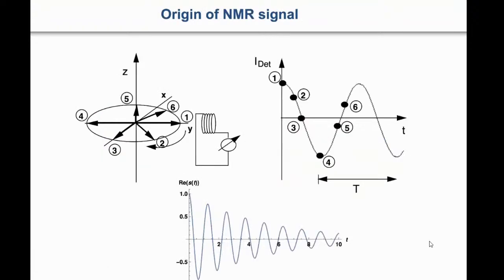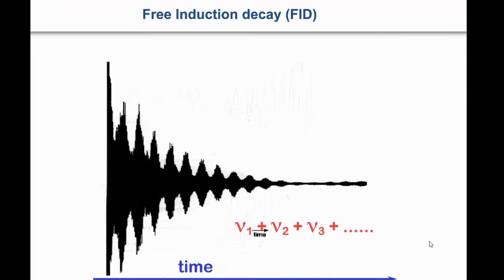Now, how do we do it? In reality, we digitize it, where there is an analog to digital converter, which digitizes all those points. We take these digital points. You can also see small points; I just made them into bigger ones. We know exactly where these points are, and you can then use mathematics or any other tool. In NMR, we have TopSpin. JEOL should have its own software to do the Fourier transform. It's a one-step thing to do. You do a Fourier transform, which will give you the frequency.